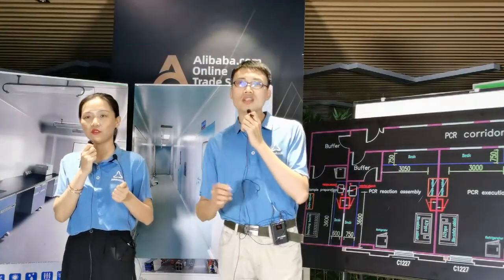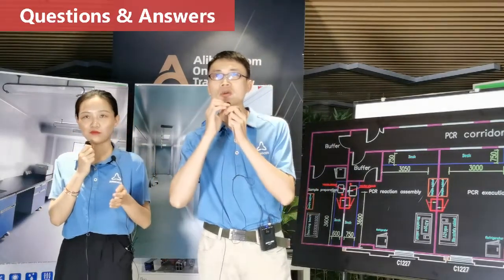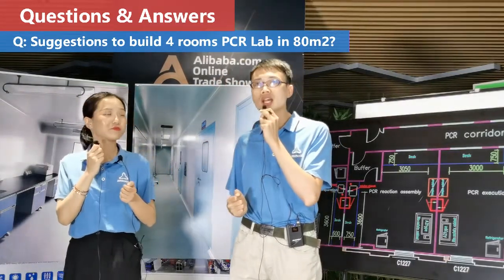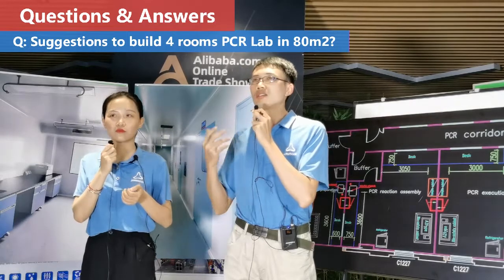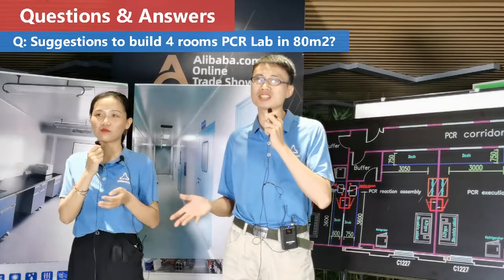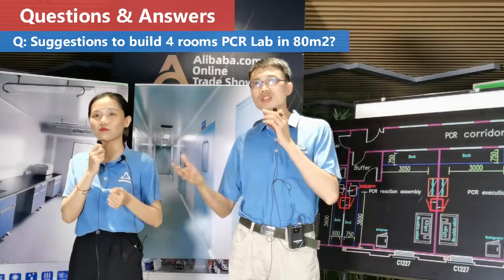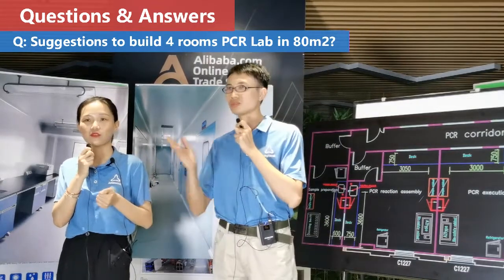And okay, here let's check the questions we received from our audience. Question number 1, one of my friends is asking: I have a plan to build a PCR lab, but I only have about 80 square meters of room space. And 80 square meters seems too tight to set up all 4 functional rooms there. So could you give me some suggestions? What shall we do? Do you have any suggestion for my friend?